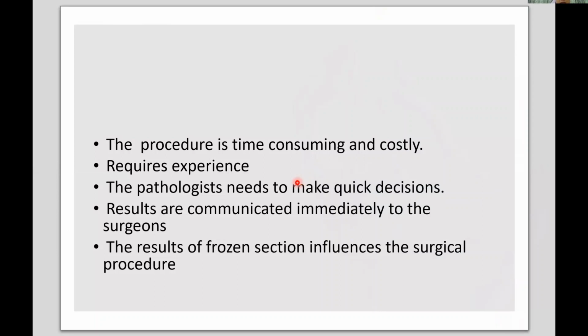It requires experienced staff, because experienced staff can make the sections better. When we want to cut sections during frozen sections, it's quite difficult. It's not as easy as the usual cutting of paraffin sections. Paraffin becomes hardened, so it's easy to cut. In frozen sections it's not really hardened, because we only use freezing to fix, and sometimes it depends on who did the sectioning.